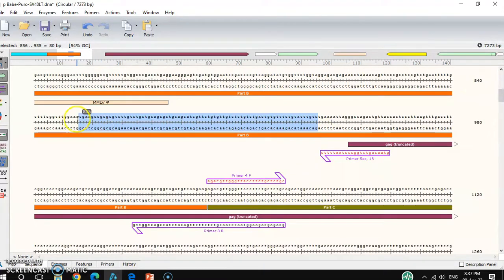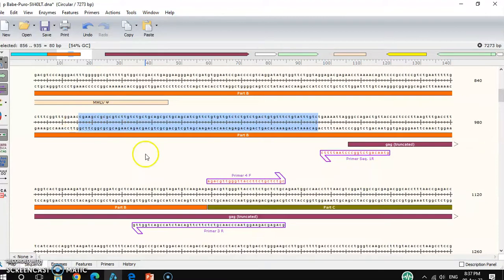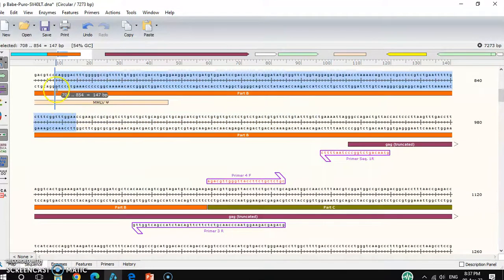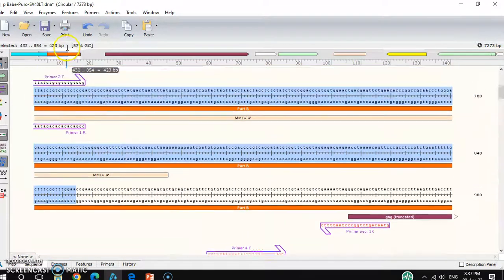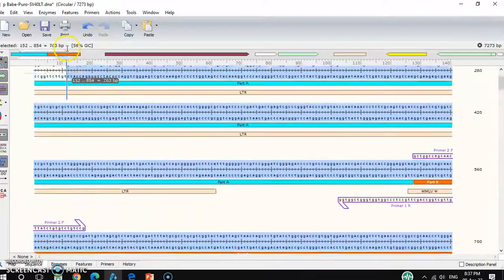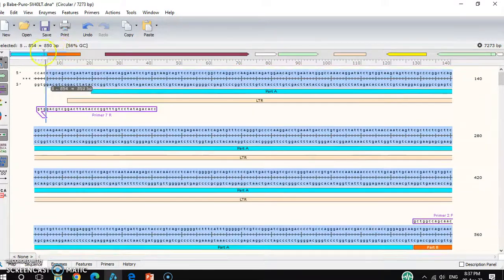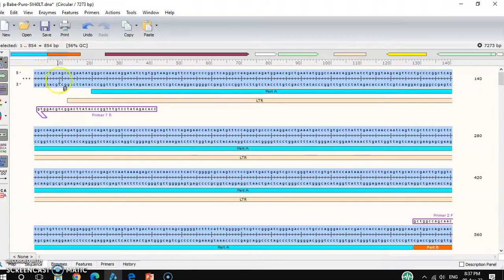From here, you have to consider for this primer. From here around 850bp you can choose.